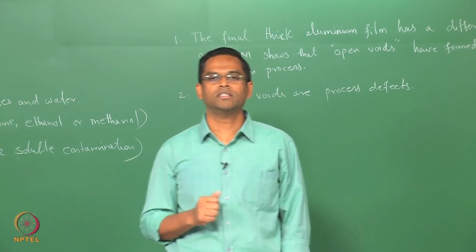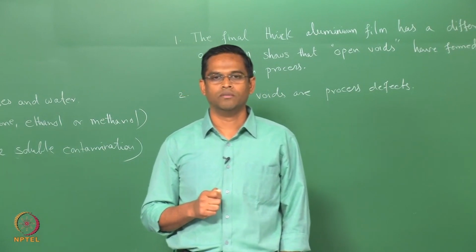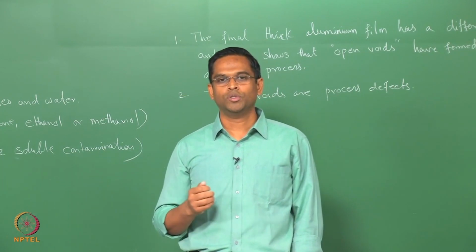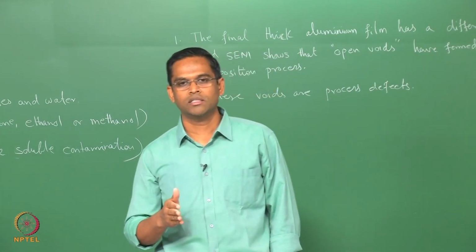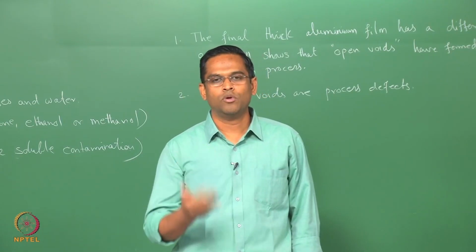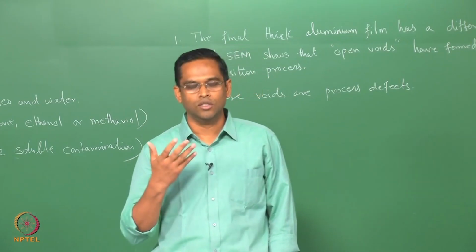So, I think with this I would like to conclude these case studies of SEM. So, I request you to go through these case studies, whether it is imaging or microanalysis, along with the theory. Then I will upload some assignments. You try to do that.